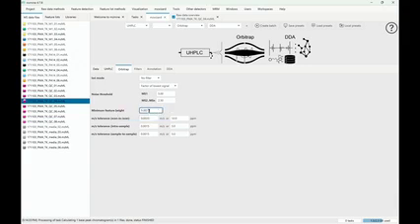We're going to set it to 5E5 for Orbitrap. That's a medium size, not too low, not too high. It's already filtering out some smaller signals, but this just means we need a feature of 5E5 in at least 1 or 2 samples, and then we're going to recognize it as a peak, and in the other samples it could also be lower. Yeah, that's okay.